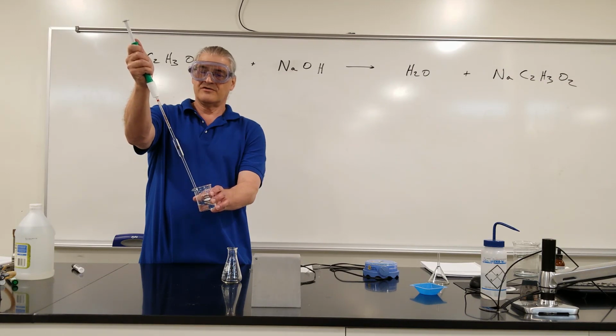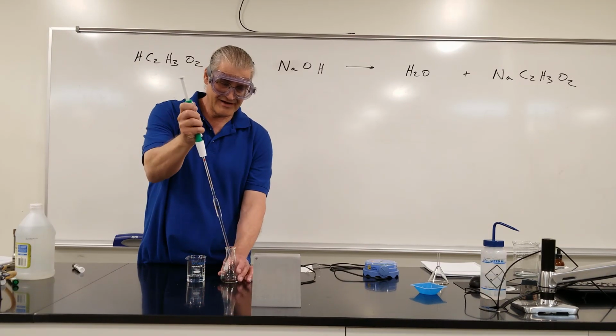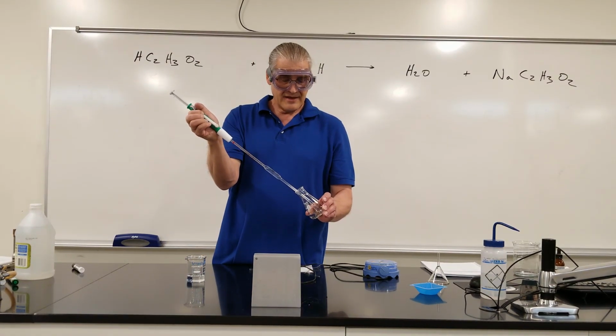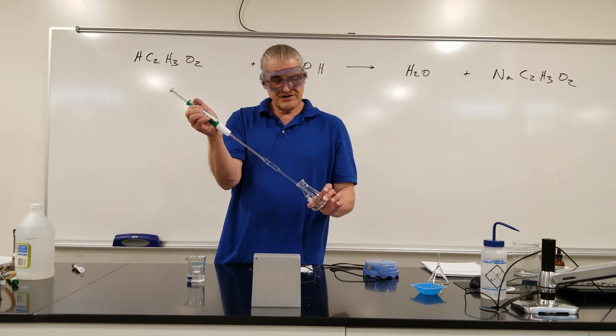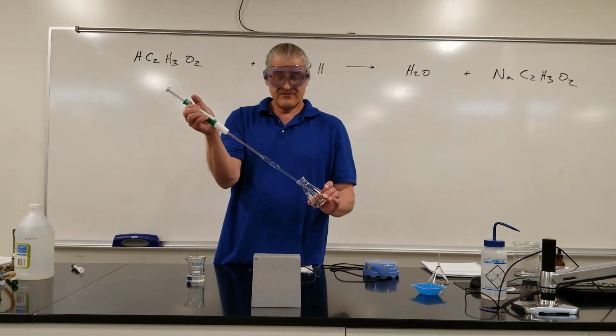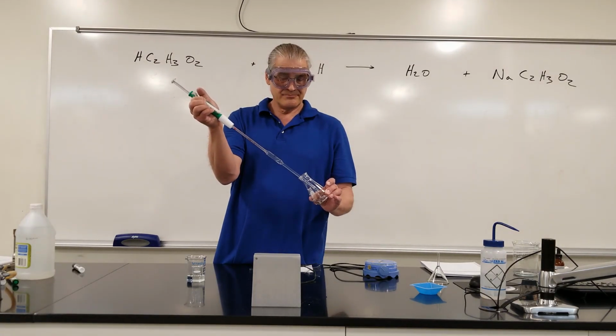and then I'm going to drain it into my flask. The proper way to drain it into the flask, you hit the little button here and it begins to drain. And at the very end, there's always a question: do you push the extra vinegar out? How do you deal with it? I'll show you in just a moment.